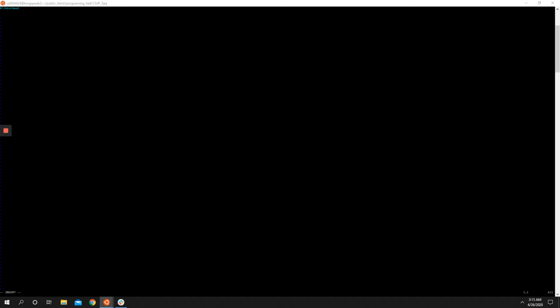For us, we're also going to be making this a Slurm script, so I won't go into the Slurm stuff, but we're just going to put a little thing up here that tells it that you give it up to 4 hours to run on at least a 20 core node and running on the Girth group partition.